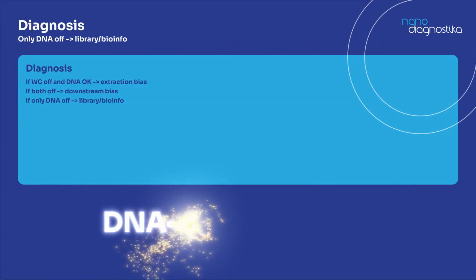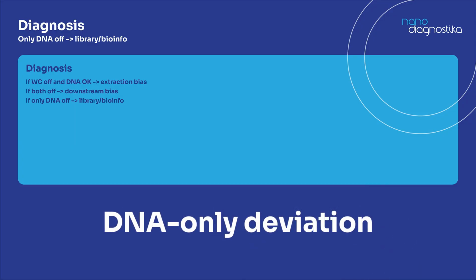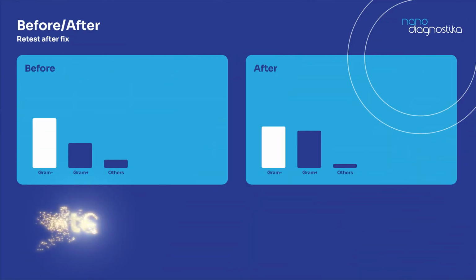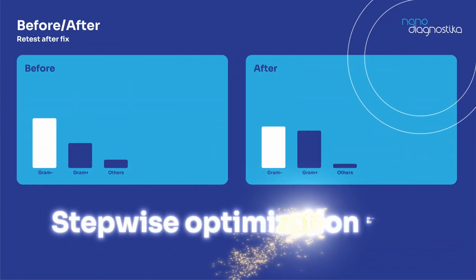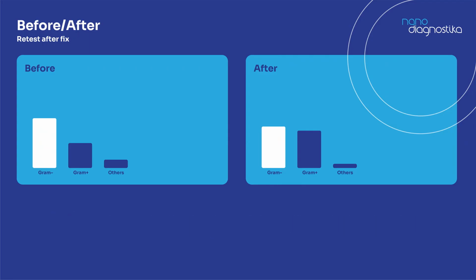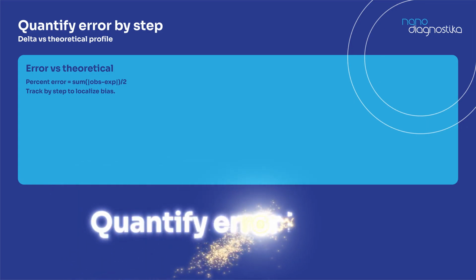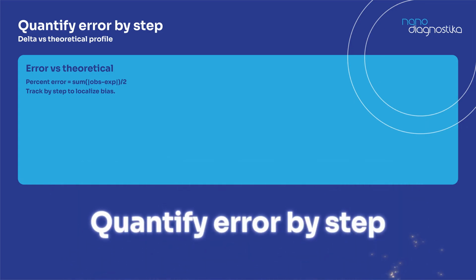This two-pronged approach essentially isolates the variables. You can quantify how much inaccuracy comes from extraction versus how much comes from later steps. In practice, Zymo research recommends first optimizing the downstream workflow with a DNA standard to eliminate library prep and analysis biases, then running a whole cell standard to see if any additional bias appears during the extraction phase. By sequentially deploying the DNA and whole cell controls, you ensure that each part of the pipeline is finely tuned and any lurking biases are exposed and addressed.